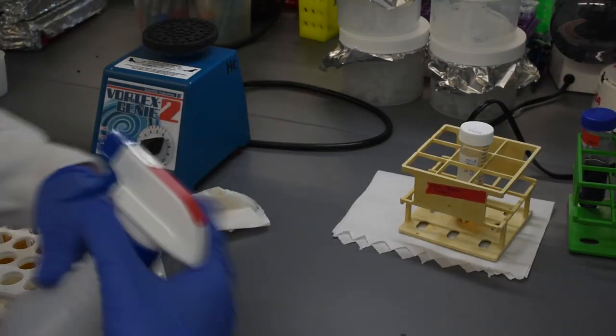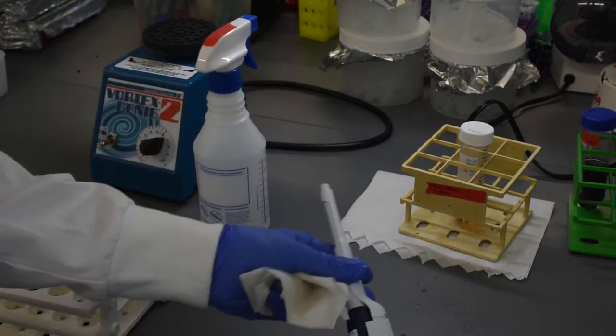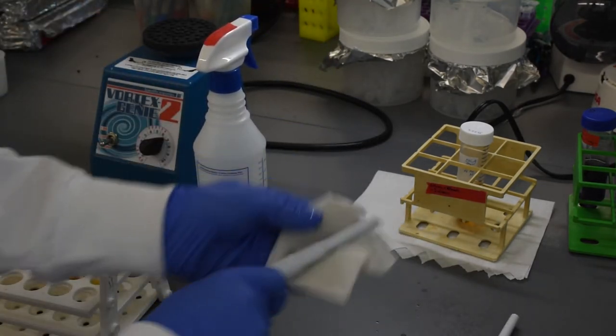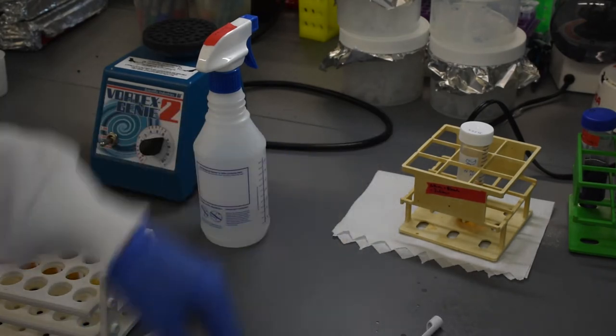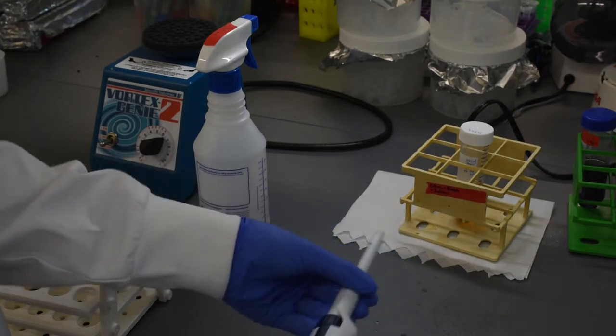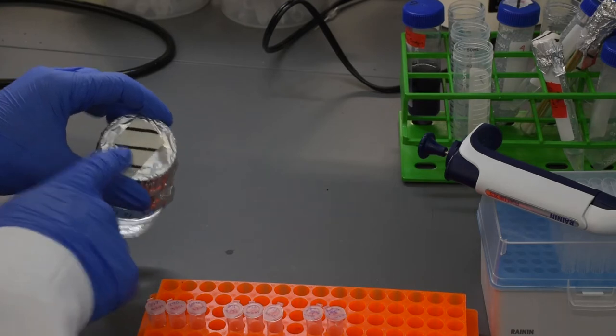Clean off your 1000 microliter pipette with ethanol or bleach before proceeding. Add one milliliter of sterile water to each cell pellet.